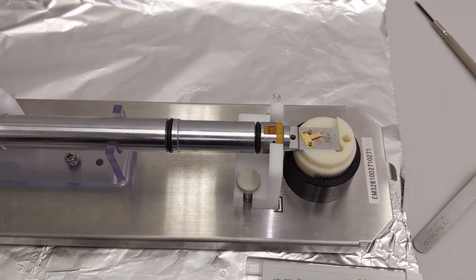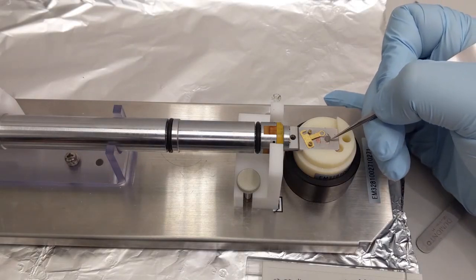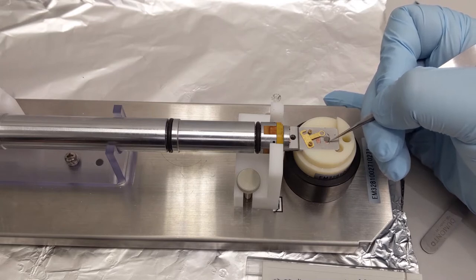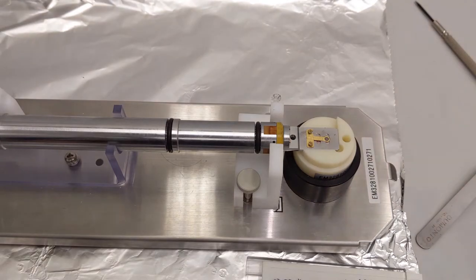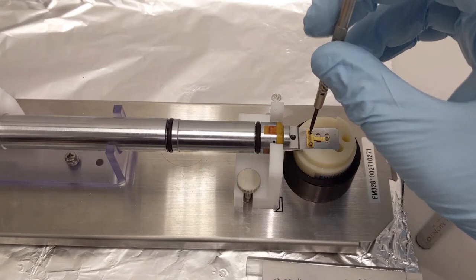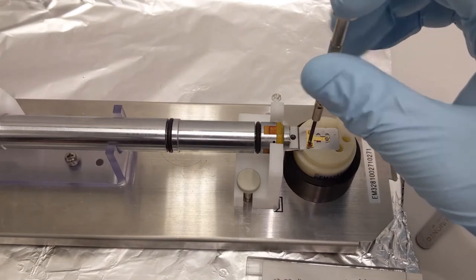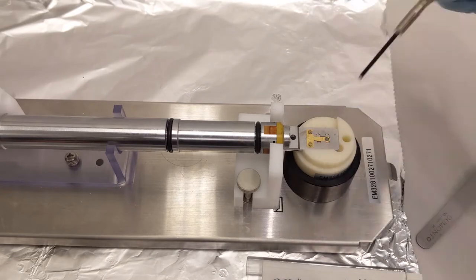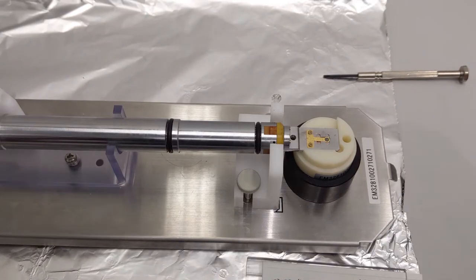And we place the sample into there. Then we tighten the screws down to clamp the sample in place so that it doesn't fall off inside the vacuum. And now the sample is ready to go into the vacuum, into the microscope.